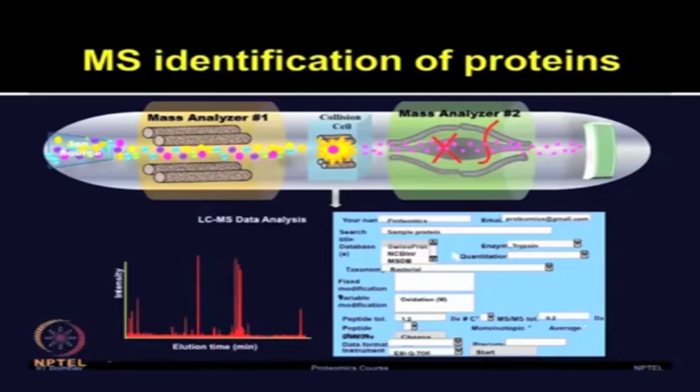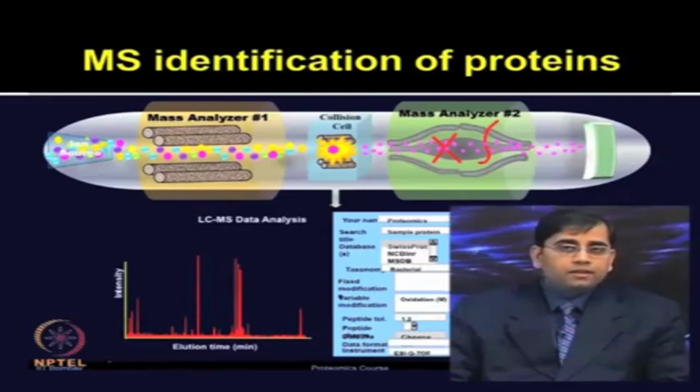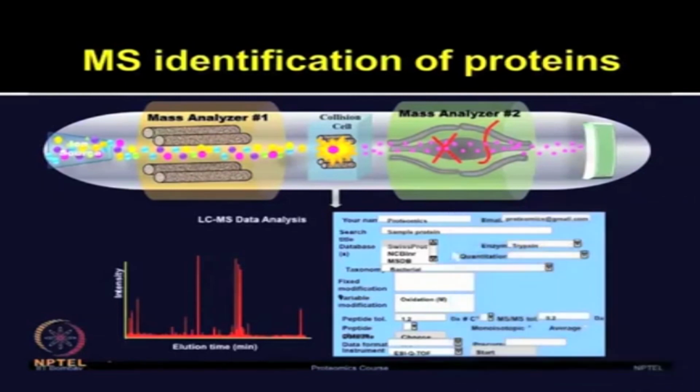These interesting 38 differentially and significantly expressed proteins were excised from the gels and subjected to MALDI-TOF mass spectrometry for analysis. The authors also employed a liquid chromatography tandem MS/MS system for analysis of these spots, and then the data was analyzed using the Mascot search engine.